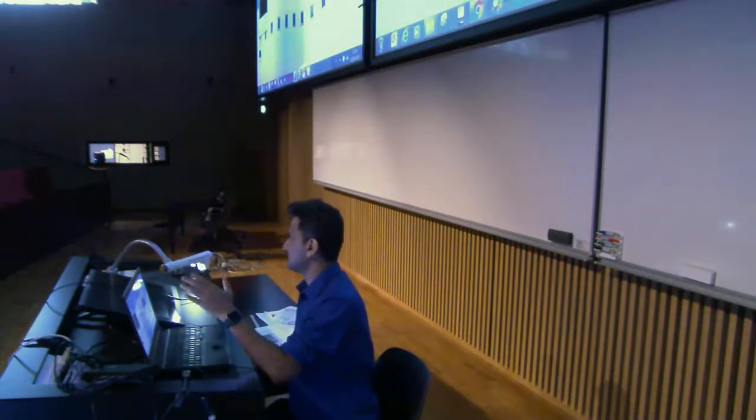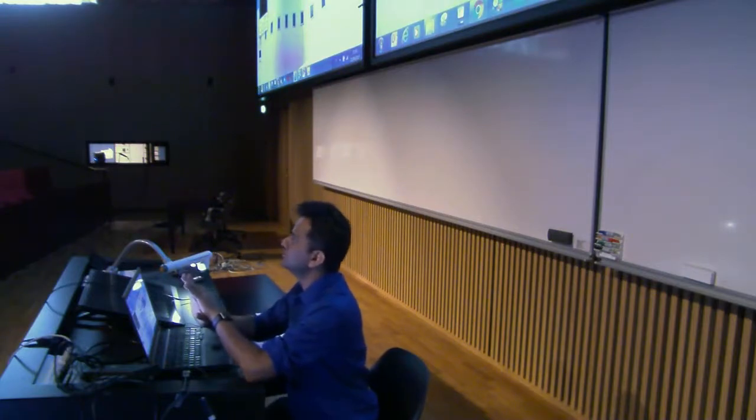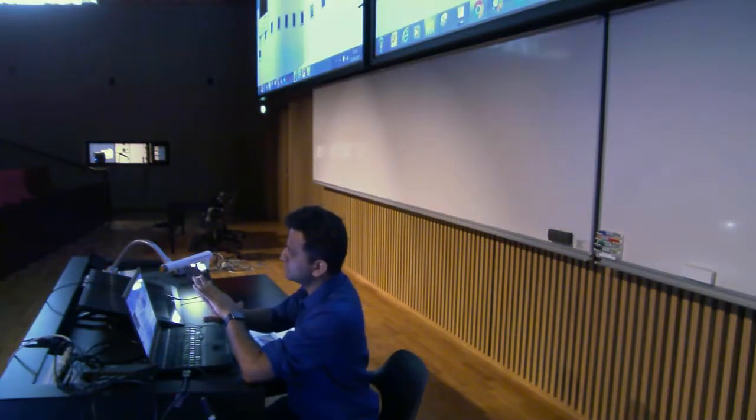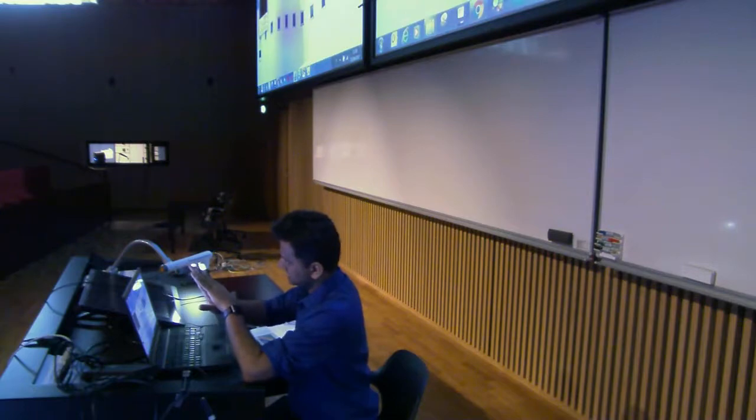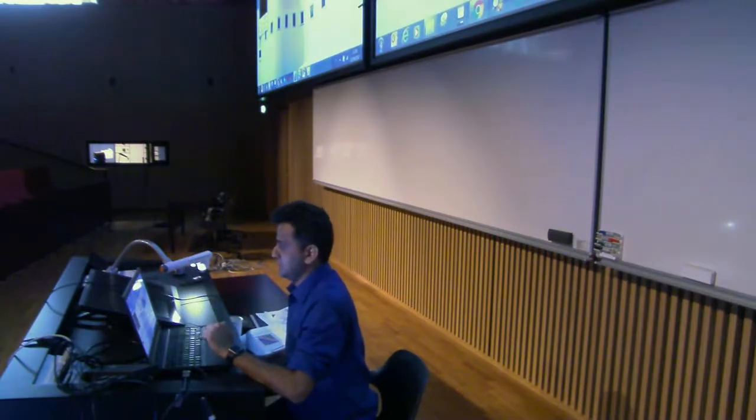You can apply, and it will take time because registration is an optimization problem. So it will try to find the principal component which would correct your movement from one time frame to another time frame. That is also possible. I'm not going to spend time on this. Plugin, stitching, time lapse.